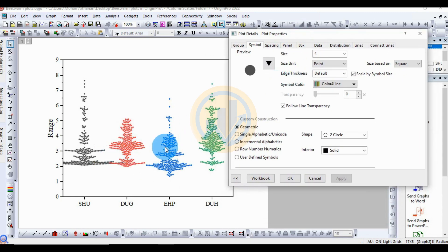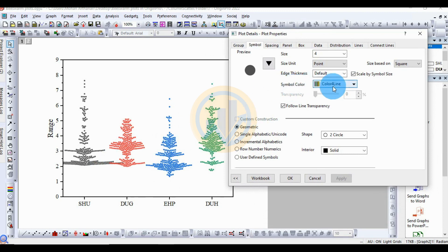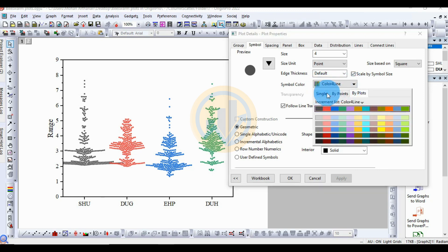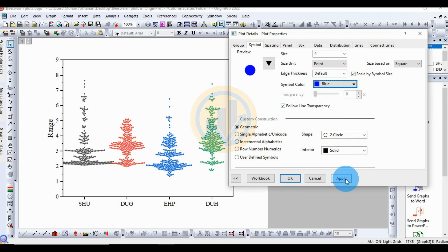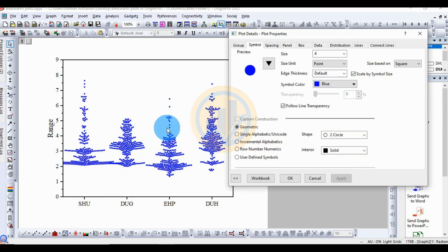Now change the color for the beeswarm plot. For single color, the standard is for the color of the line. Click the button to change the color. If you use the single option, all data points will be a single color. Choose blue — all four datasets will have the same single color.